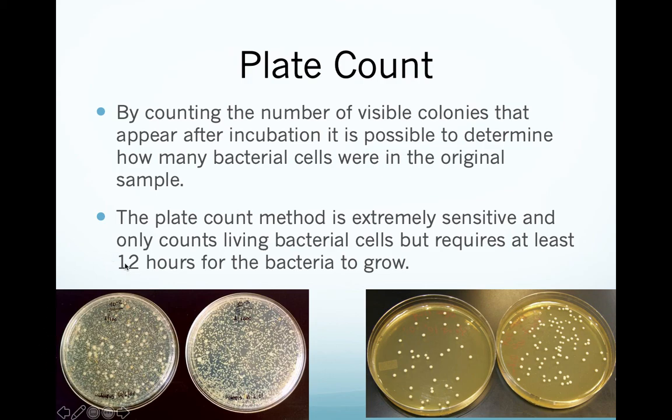Well, there's too many bacteria on this petri dish. That's way too many bacteria. I can't count that. That's something called TNTC, too numerous to count. You cannot tell how many bacteria are on that sample. You just can't do it. You cannot get in there and count them all.